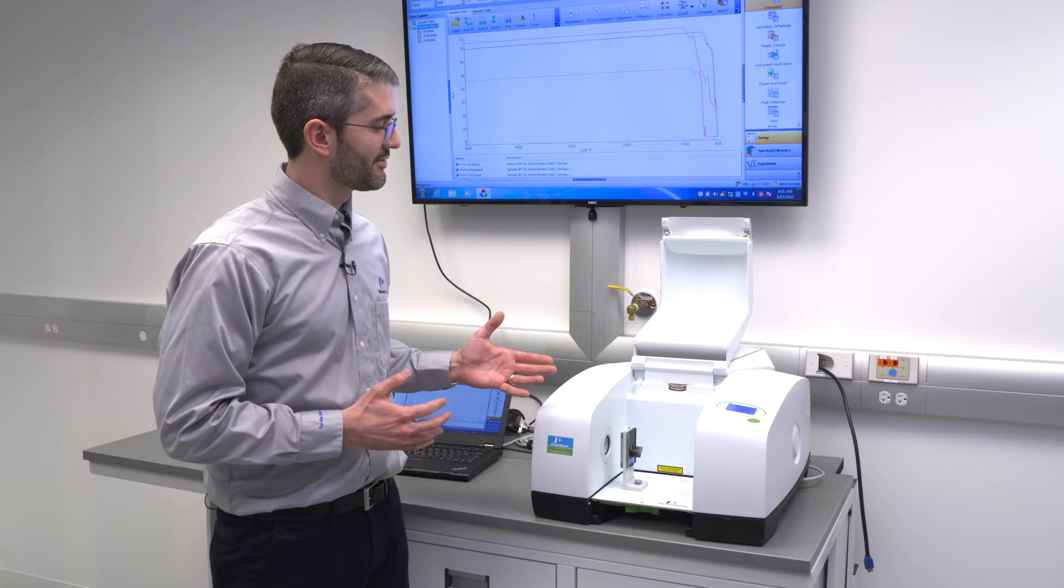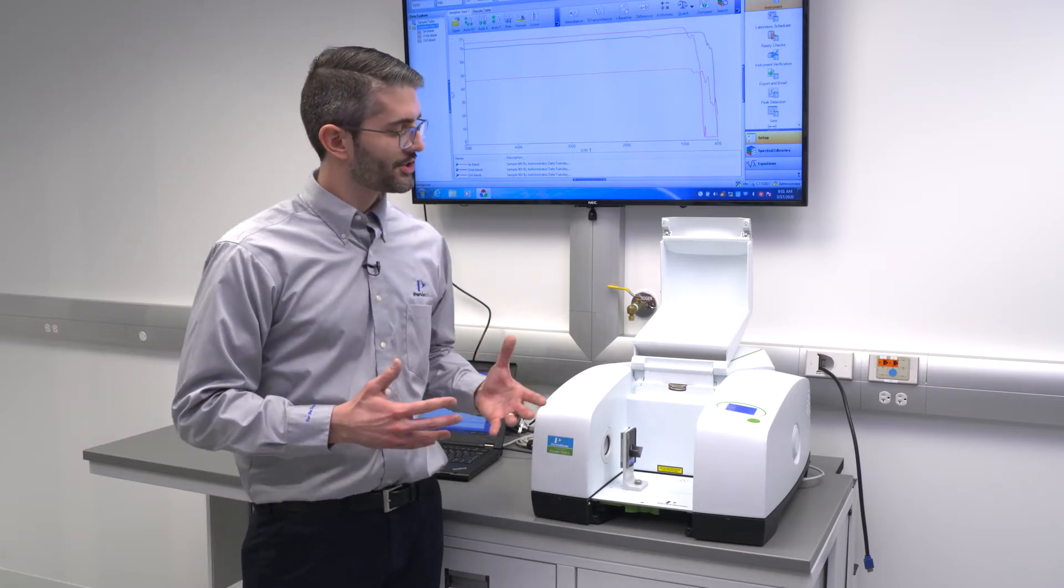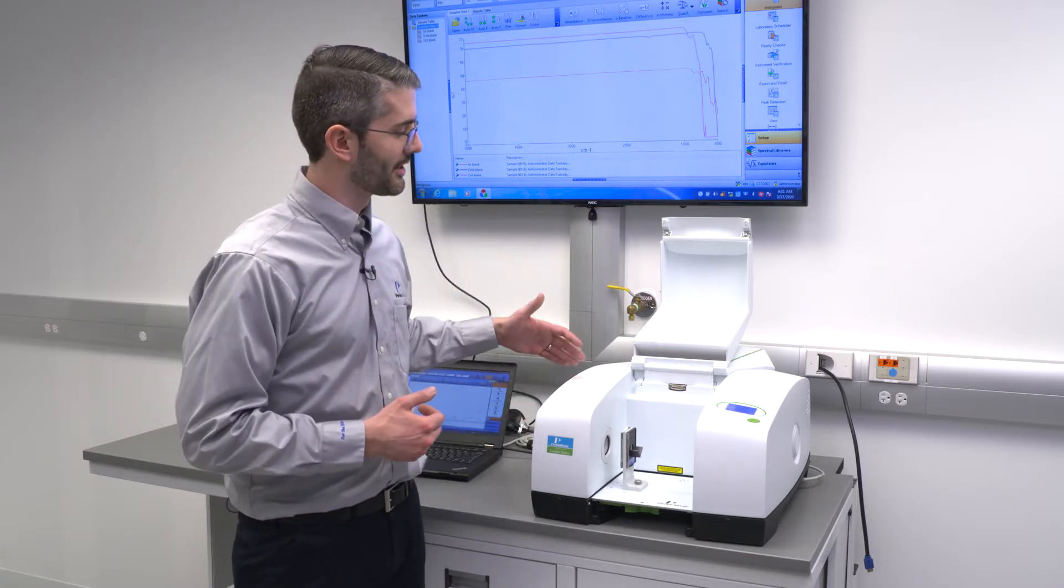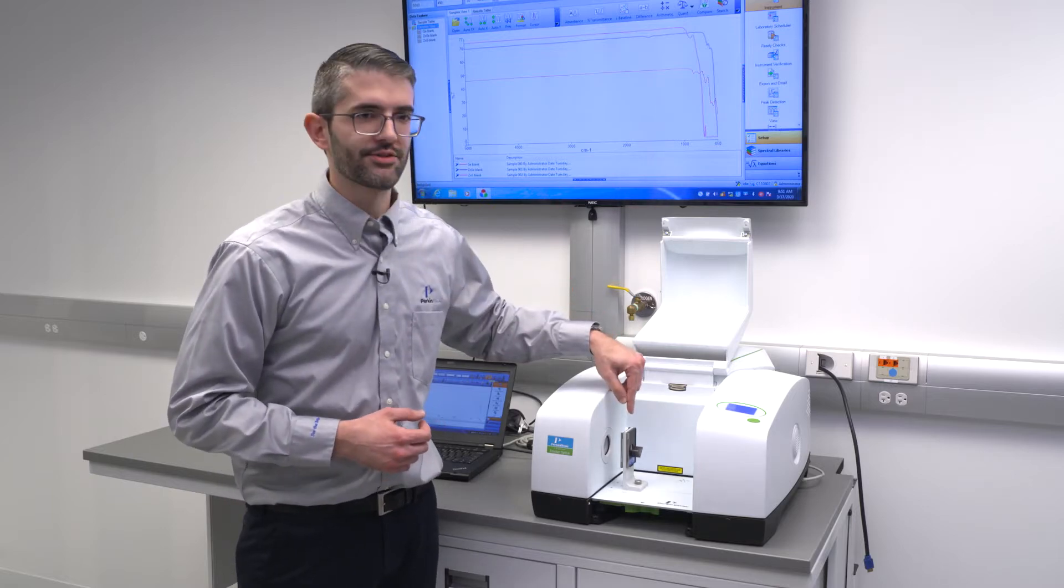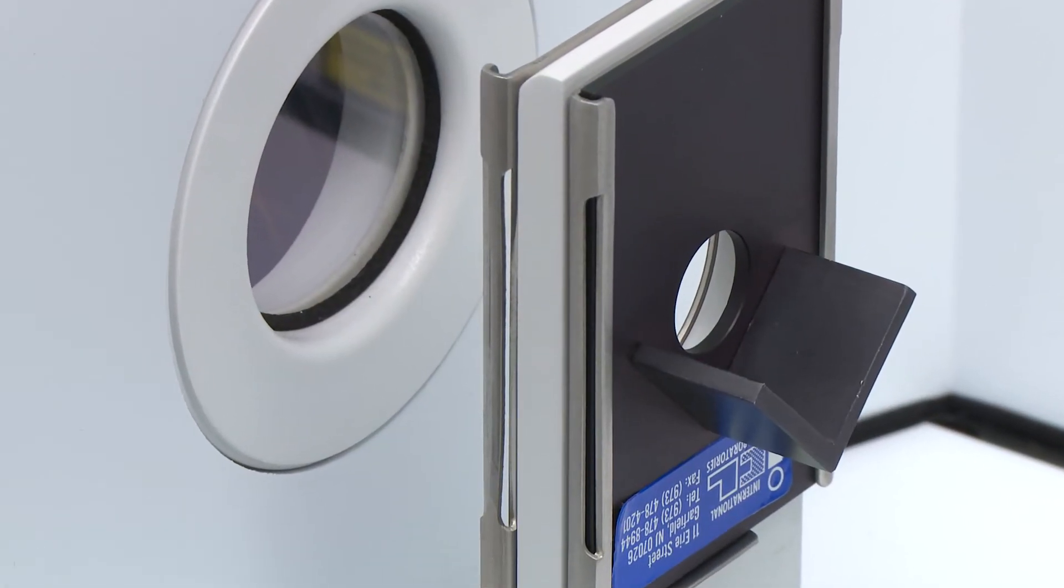The design benefits are incorporated in the system to prevent measurement of light which is back reflected by the sample. The sample is placed here in the sample compartment within the Frontier Optica for measurement.